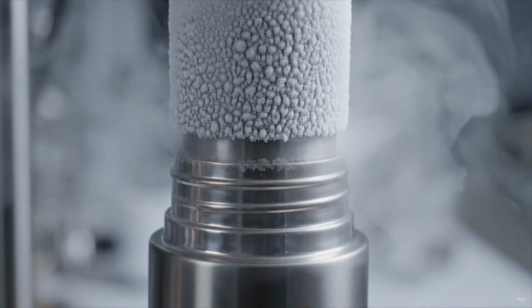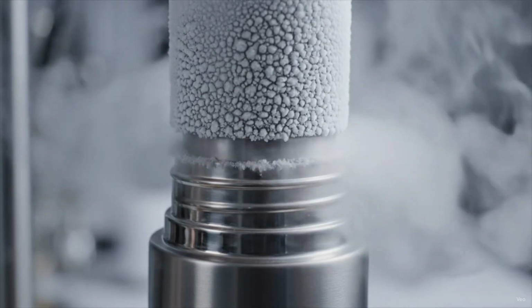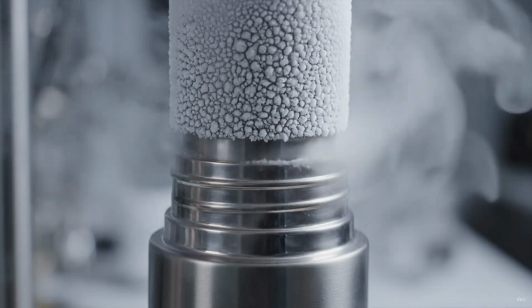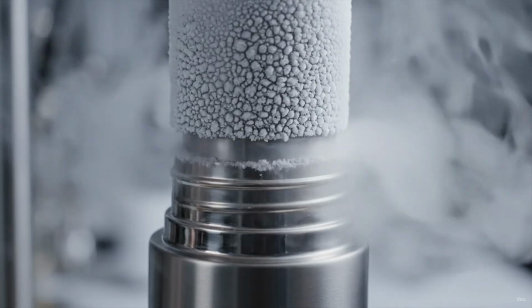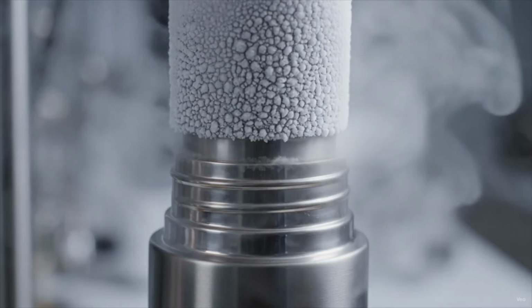So you now invest in a series of compressed air filters, taking your compressed air, removing particulates, removing water vapor, removing CO2, hydrocarbons, and you still see that your liquid nitrogen is cloudy.